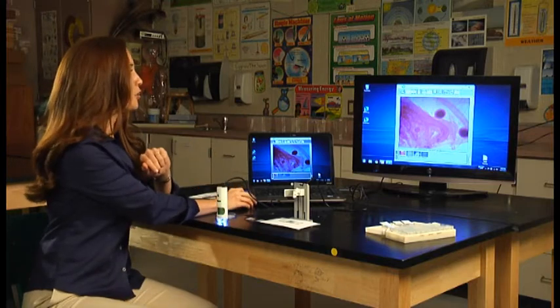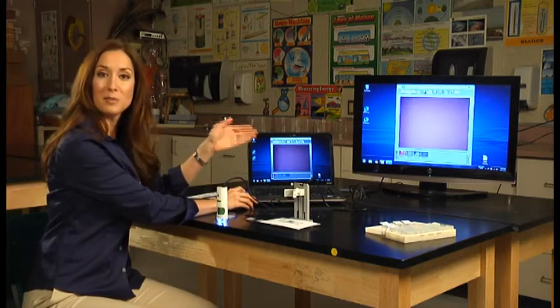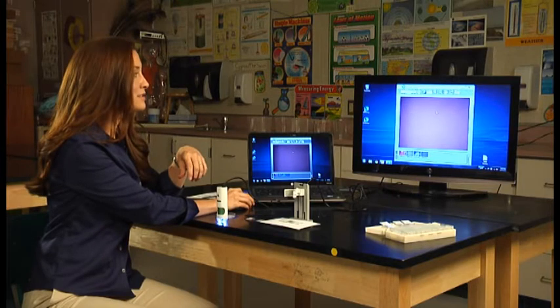First, let's go back to clear out the picture. This brings us back into the live mode, and then double click again to bring us to the full screen.